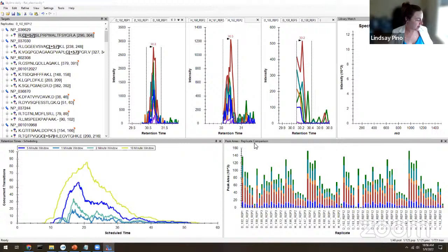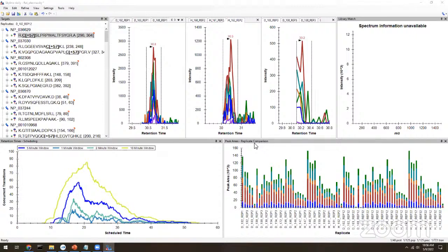So there's been a lot of talk about what if you don't have a library. For the data Lindsay is showing, at the time we used just the public libraries and found that only about 50% of the peptides we were interested in targeting had library spectra. So we started this experiment just targeting all tryptic peptides, and these are the ones we thought we could detect.